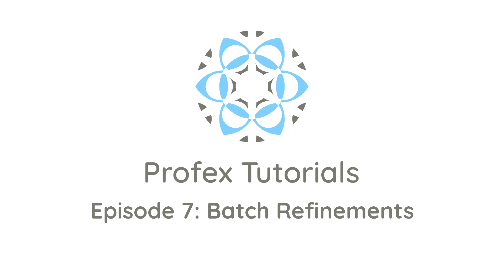Today I'm going to show how we can process large numbers of datasets of similar composition very easily in a batch refinement. So stay tuned.